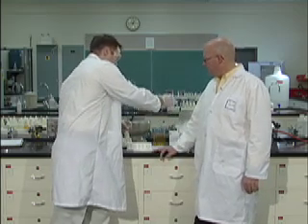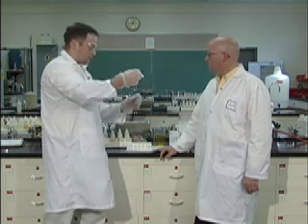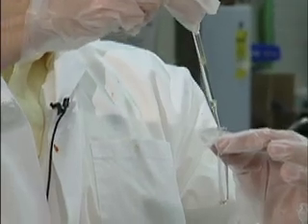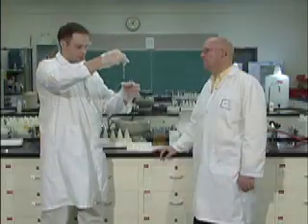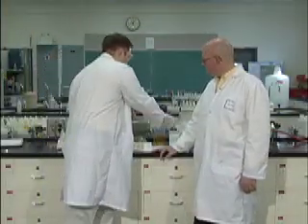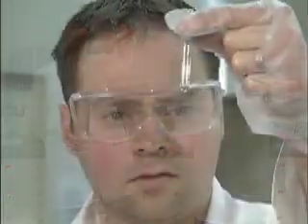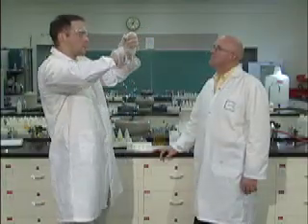Okay. And you're just going to take a little bit of your unknown solution and put it in the bottom of your tube. How many drops? I'm guessing about 5 drops. All right. Oh, just a little bit. Yeah, right. So about that much. Can you see that? I can see it. Okay, so just a little bit, about half a fingernail width, I guess you could say.